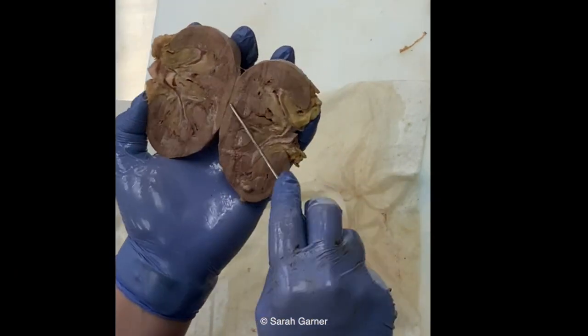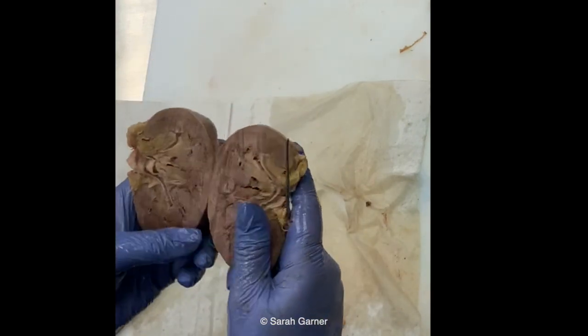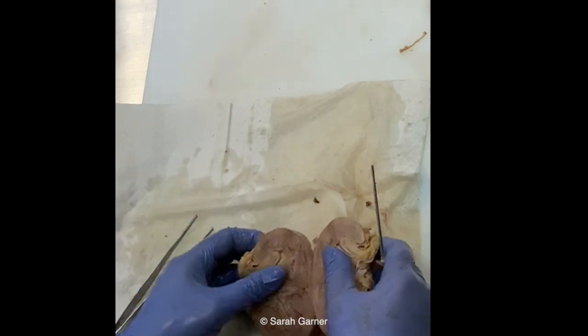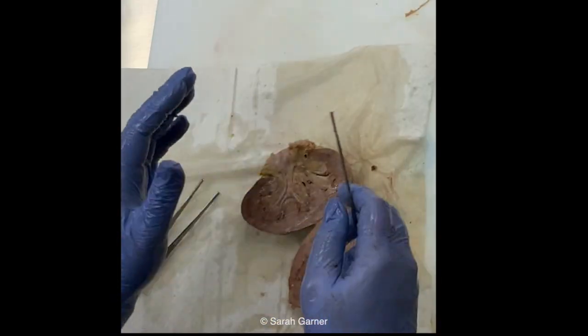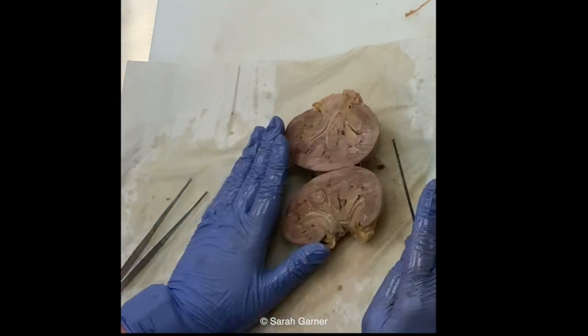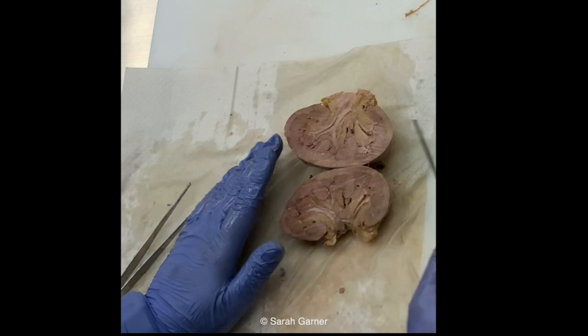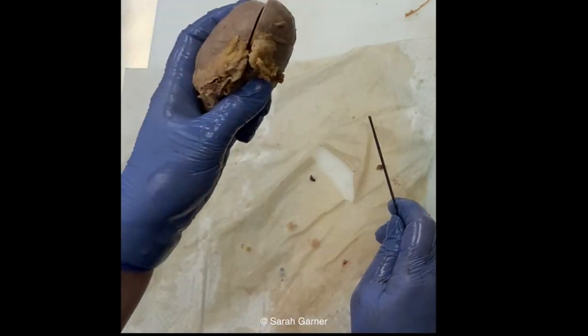You can inspect the cortex and medulla, see if you see anything abnormal. You can note the thickness of the cortex. You should probably take a nice picture of this. And then what you do with your kidneys, which breaks my heart as an anatomist, but after you get this nice bisection and you see everything you need to see, you're actually going to section through it, because this is not thoroughly sectioned enough. Right?